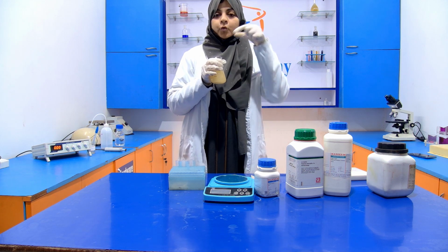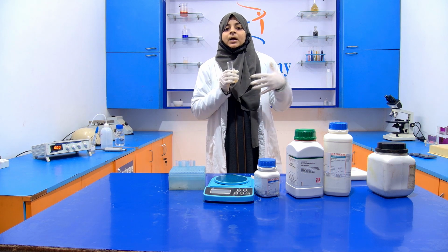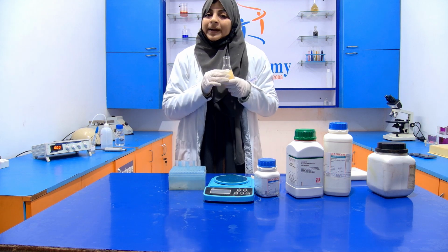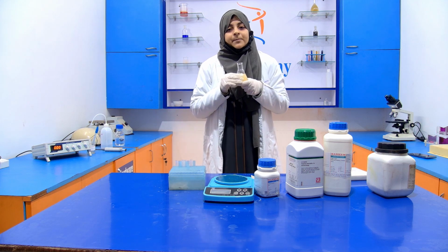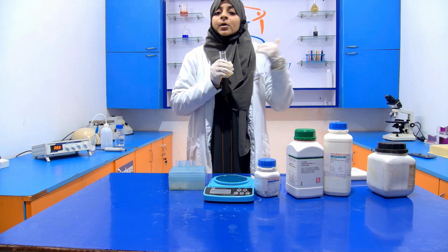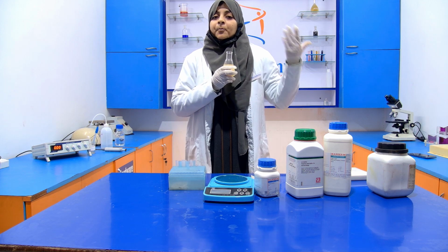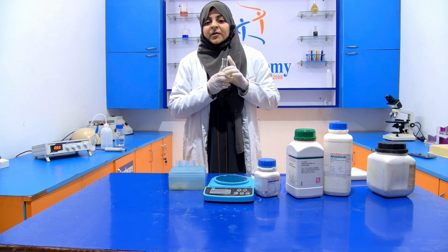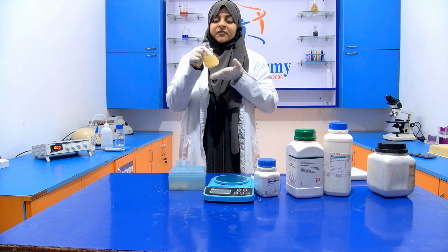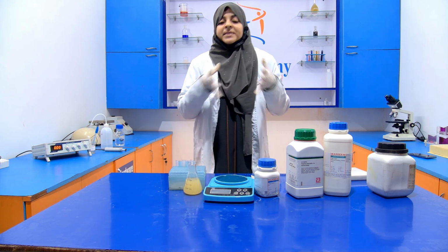Now what we have to do is put a cotton plug into it, wrap it with the autoclaving paper, and autoclave it at 121 degrees Celsius, 15 psi pressure for 20 minutes inside the autoclave. Once it is autoclaved, it is ready for pouring. After that, we perform our next experiment, that is pouring or spreading with the help of this media. So this is all about the media preparation.